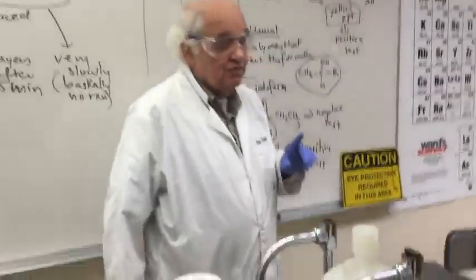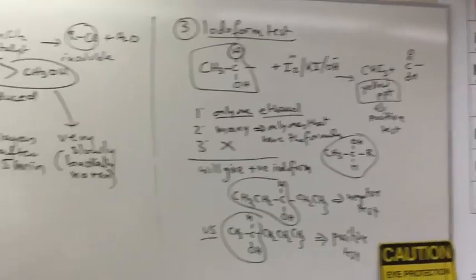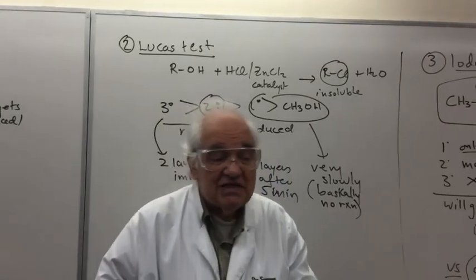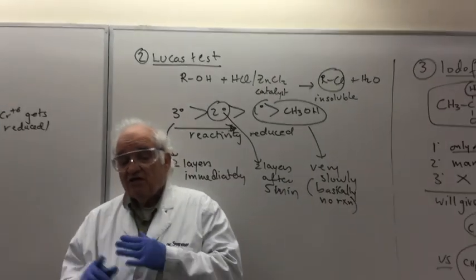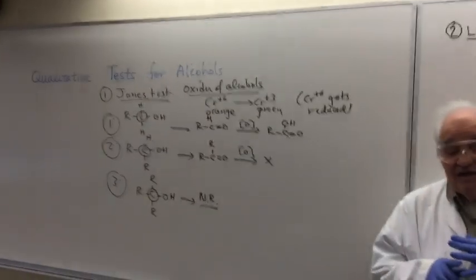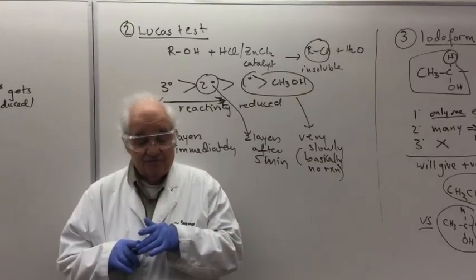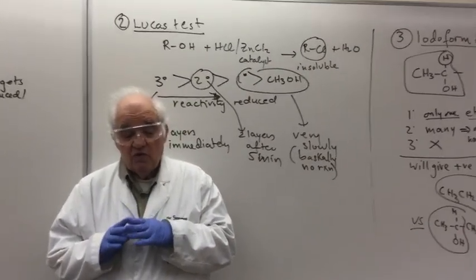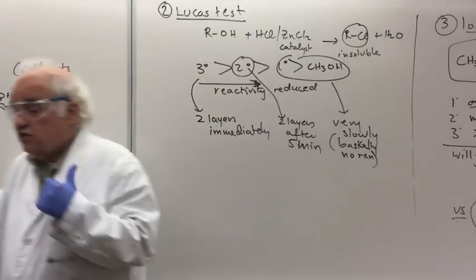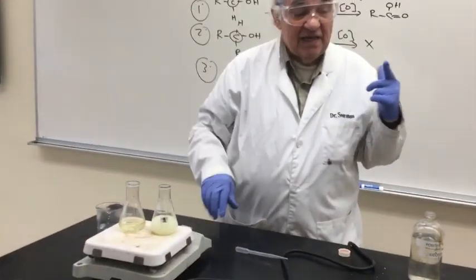So what are we supposed to do? What I would like you to do first is you go to your lab manual, and I think the page is 273, and you have a list of possibilities. The very first thing you do is you fill in that table with the structures. Okay, and classify those alcohols that you see over there as primary, secondary, or tertiary. Then, what you do then is the following. Check your unknown what it is. In our situation, we said our unknown is either primary or secondary, cannot be tertiary.